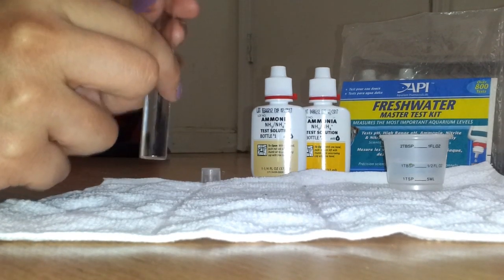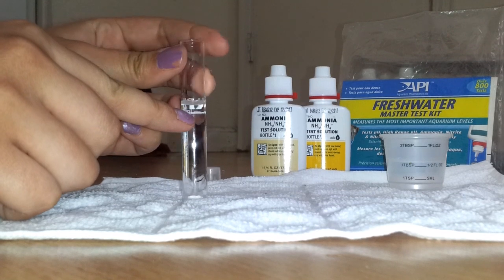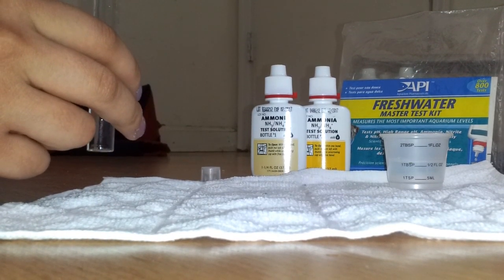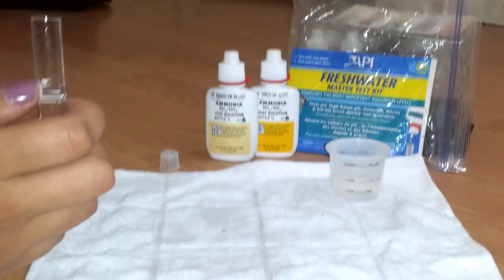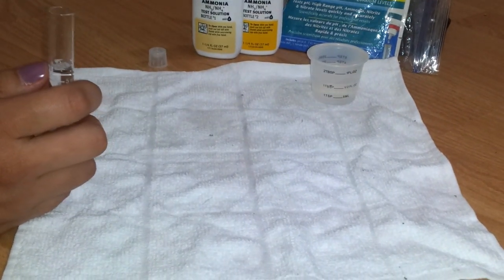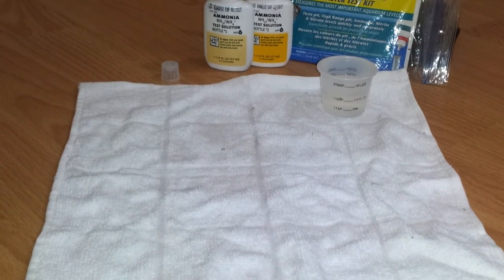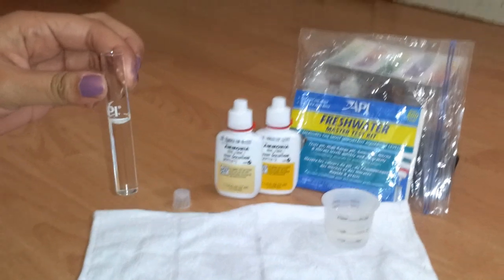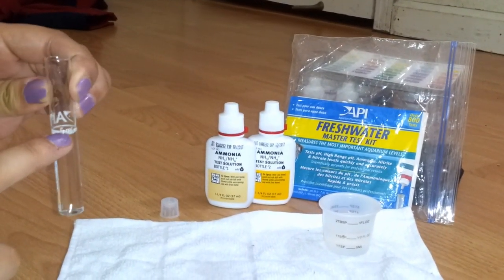The line is right here where the water is supposed to be. What I learned from the pros is to just flick it out — and don't be scared of flicking out too much, because your water is not all gonna come out of the test tube. Just do it like this, and now as you can see it's right at the line where it's supposed to be.